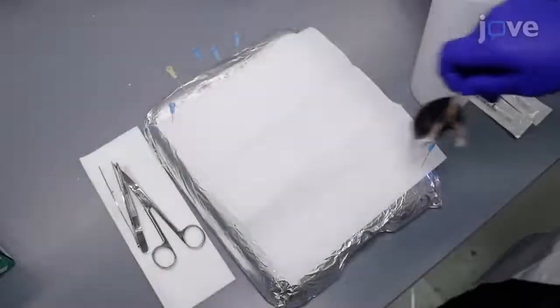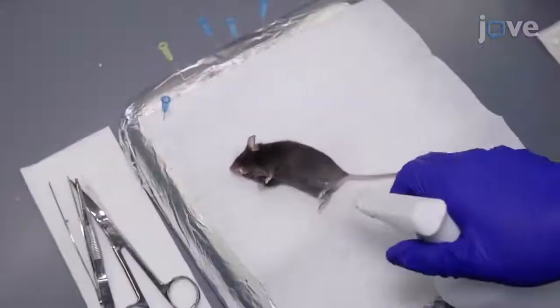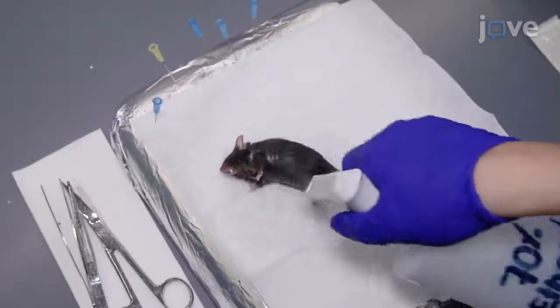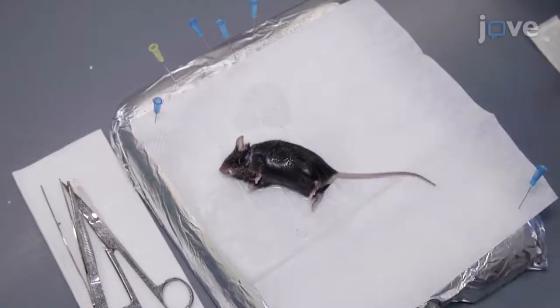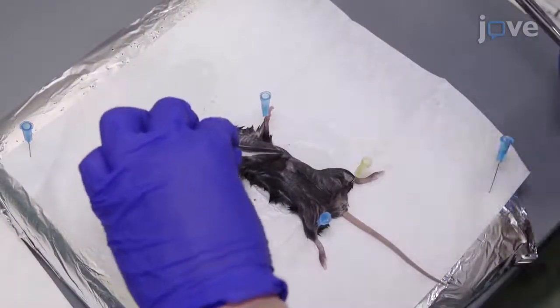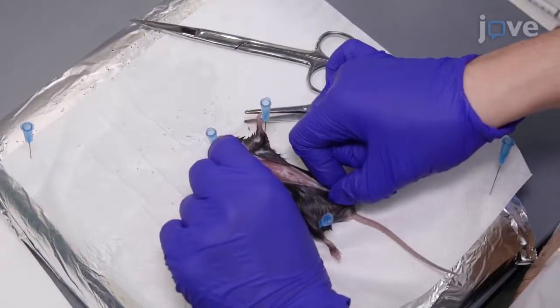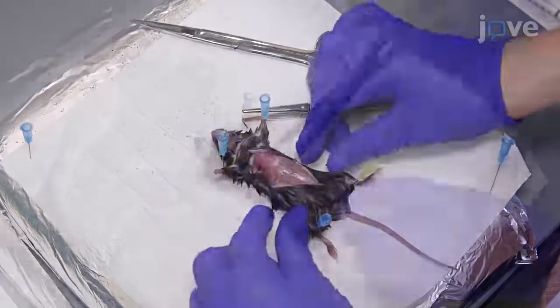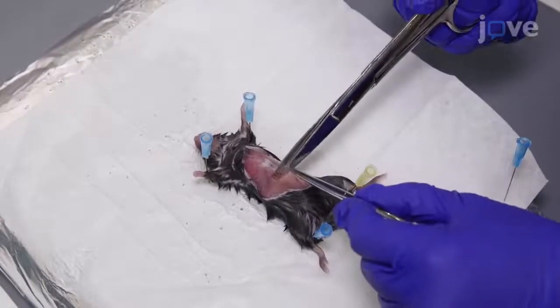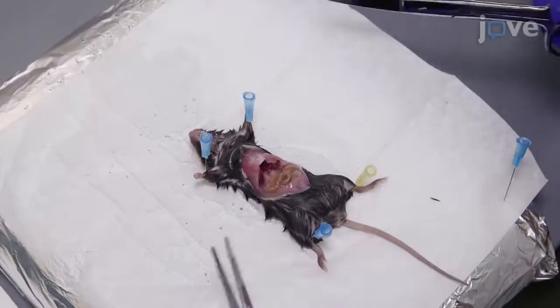Begin by laying the mouse on the dissection pad with the abdomen exposed. Generously spray the body of the mouse with 70% ethanol prior to making any incisions to sterilize the dissection area. Make an incision into the skin across the abdomen and pull simultaneously on both sides of the incision with fingers or forceps. Then cut the peritoneal cavity with scissors to expose the internal organs.